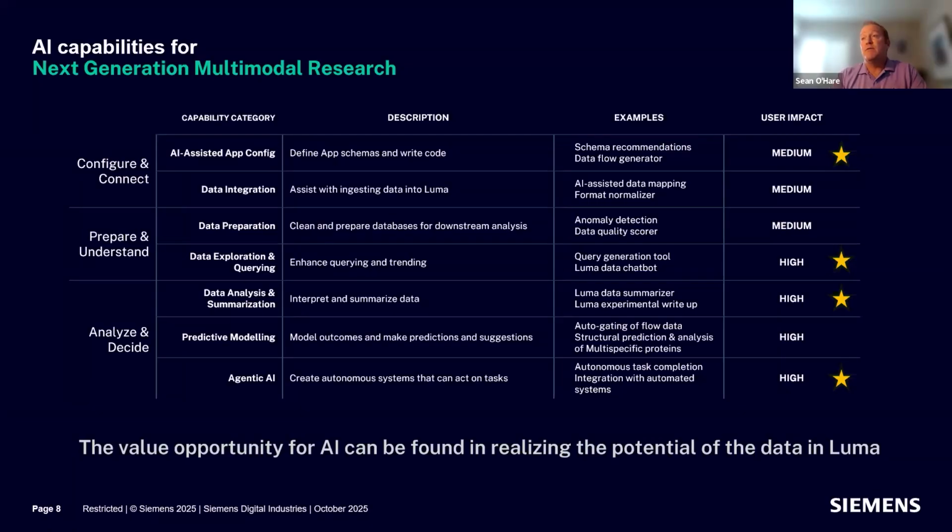This is a huge game saver, time saver. I'm sure Phil will talk about that a little bit. That's one. We can just assist with data ingestion, really simple, straightforward things like enhanced querying and trending, and so on and so forth. So without too much further ado, I'm going to hand this over to Phil, who's going to show you several demos and talk about some of the things I just mentioned in more detail.